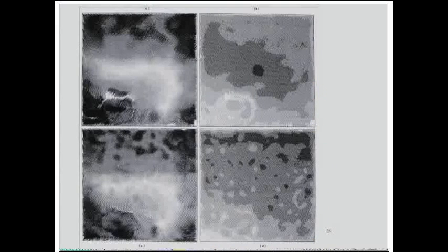So here's an example. Sorry, Richard, I had to scan this out of your paper because I couldn't find any of my own. But this is from Richard's paper from 1990, showing the unbending on purple membrane. And this is in the first step here. So here we've got the correlation peaks and the distortion vectors in one image. Maybe it's a 45-degree tilt image or something like that.